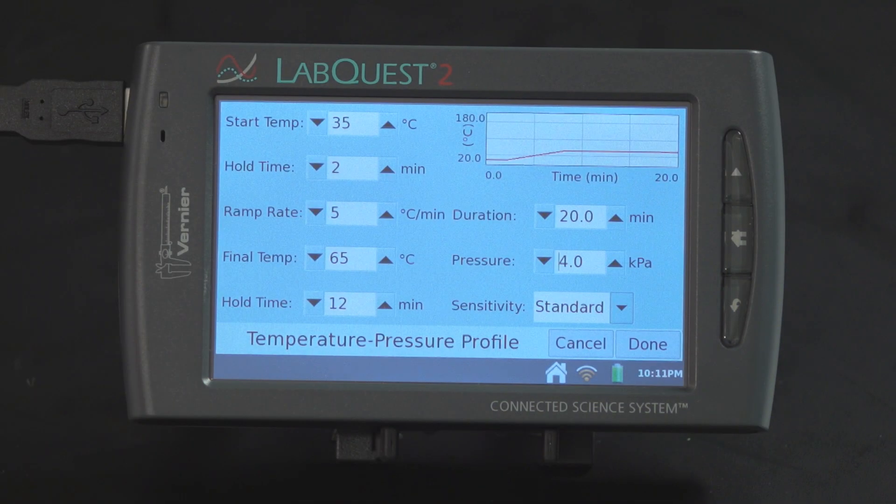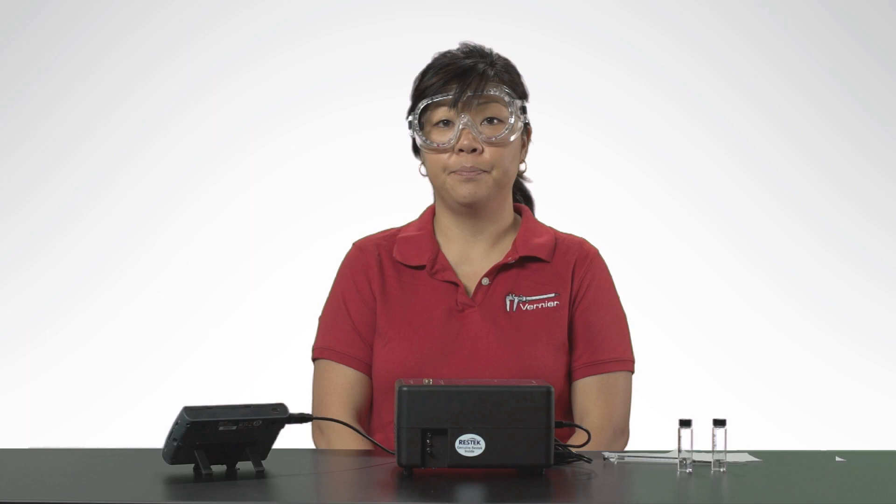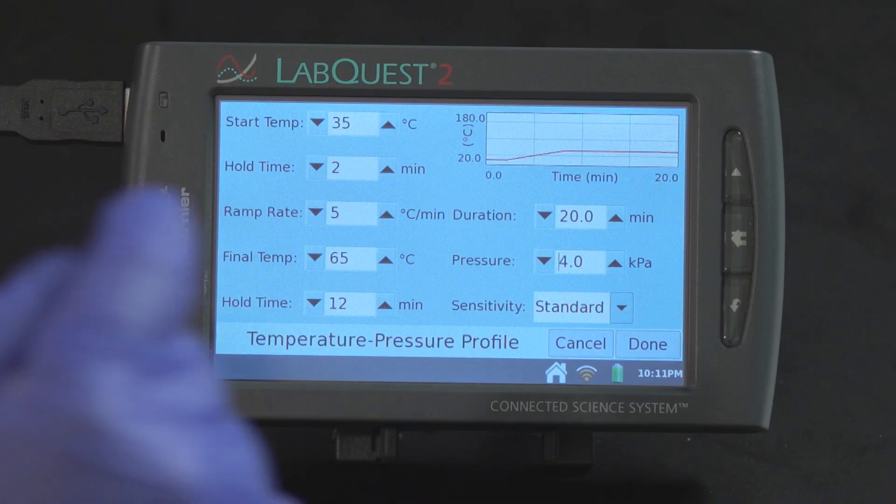Data collection will end after 20 minutes. Make sure the duration of the run is long enough to ensure all the compounds have passed through the column. Select Done to initiate Mini-GC warmup.